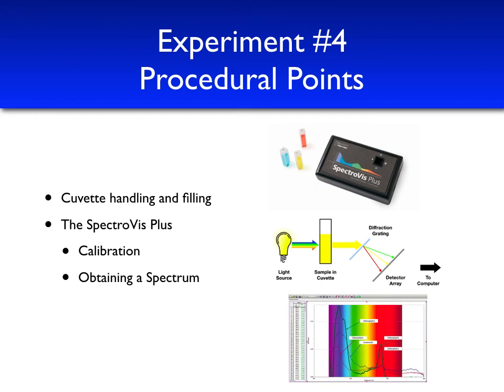We'll simply hit the collect button, and in about 2 seconds, the spectrum will appear on the screen. Usually you can keep collecting for a while, but the spectrum will not change unless something pretty drastic happens to your system, for example, if you accidentally take out the cuvette before finishing the collection of your spectrum.